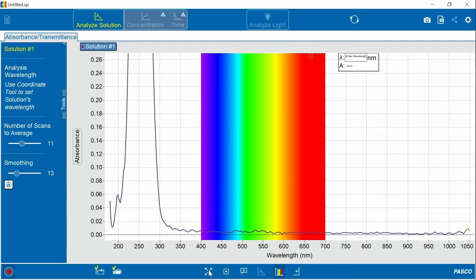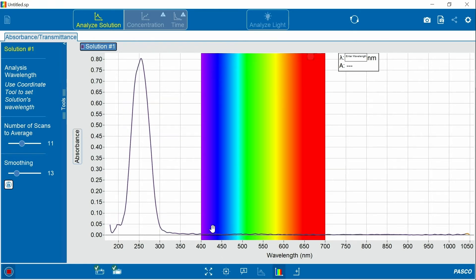I'm going to scale the data. And you'll notice that this solution does not absorb light in the visible region, but it does in the UV region. Now I can use the coordinate tool to identify the peak absorbance.